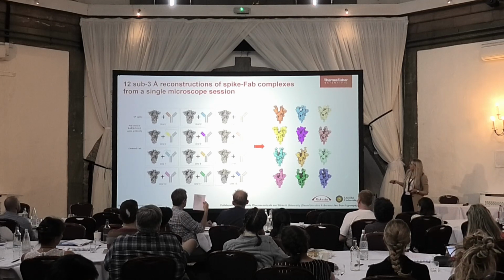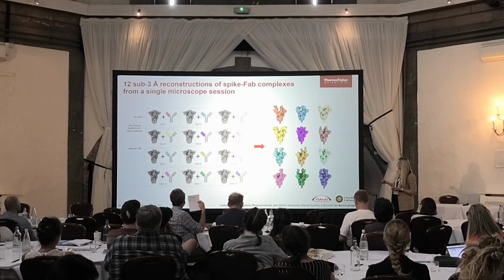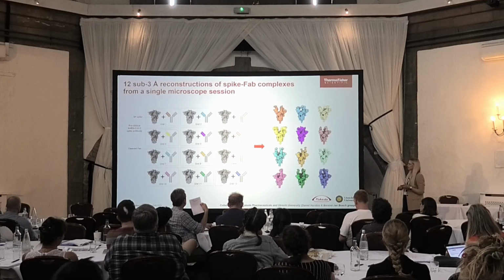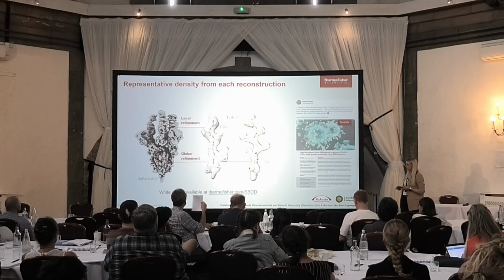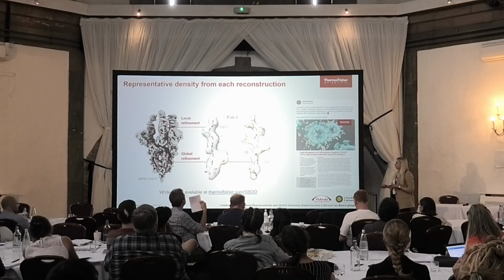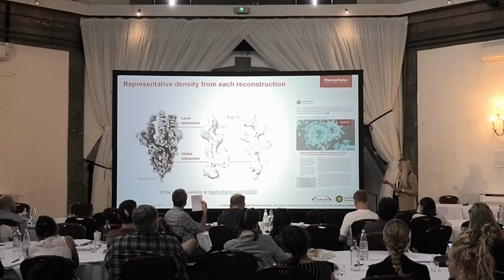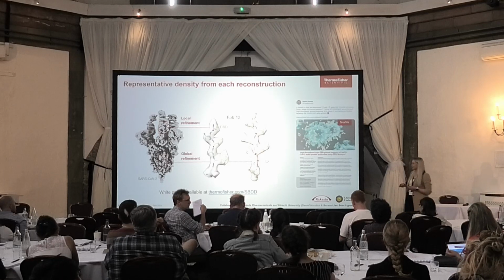So you can see here globally refined maps, and you can already see that for some of the RBDs, only 2 are up, some are 3 up, and they're closely together, some are spread out. So these are all unique maps from each of the Fabs. Then we performed local refinement for all of those global maps. So here in this little video, you can see the quality of the density in the RBD and Fab region, which really allowed us to accurately build both the RBD and the Fab, and the S2 region was really well resolved anyways, but that is also shown.